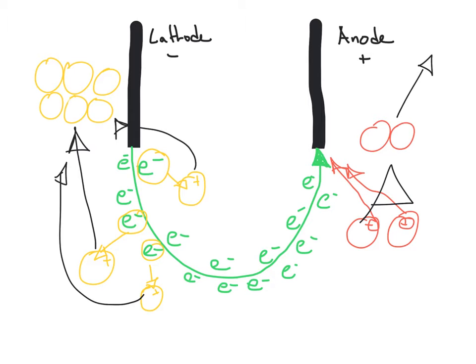So just to recap for a minute, we had positive copper ions that were attracted to the negative cathode, or the negative side of the battery. They were gaining electrons from this flow of electrons that was the electrical current. When they gained an electron, they became neutral. As a neutral atom, water no longer was ripping them apart or dissolving them, and so they came together to form our solid copper that we saw as a precipitate.